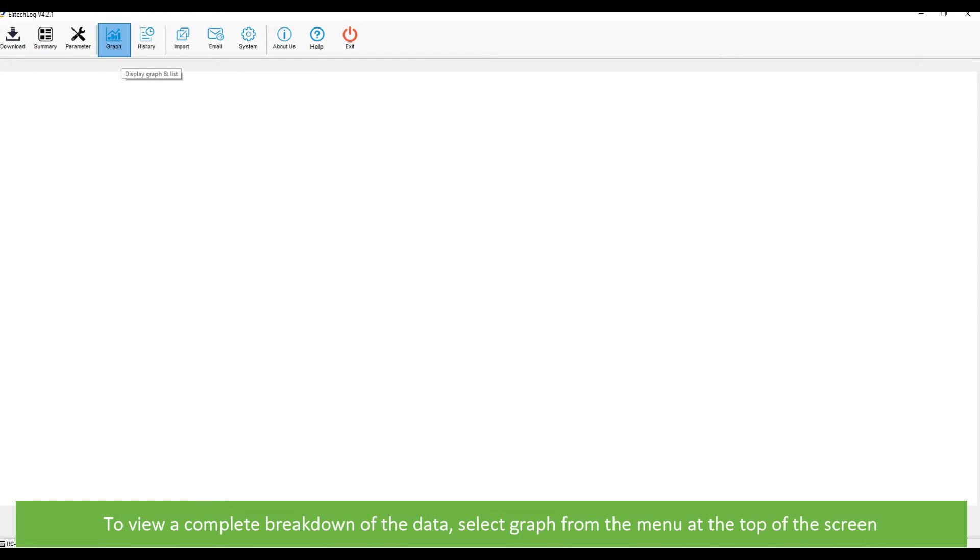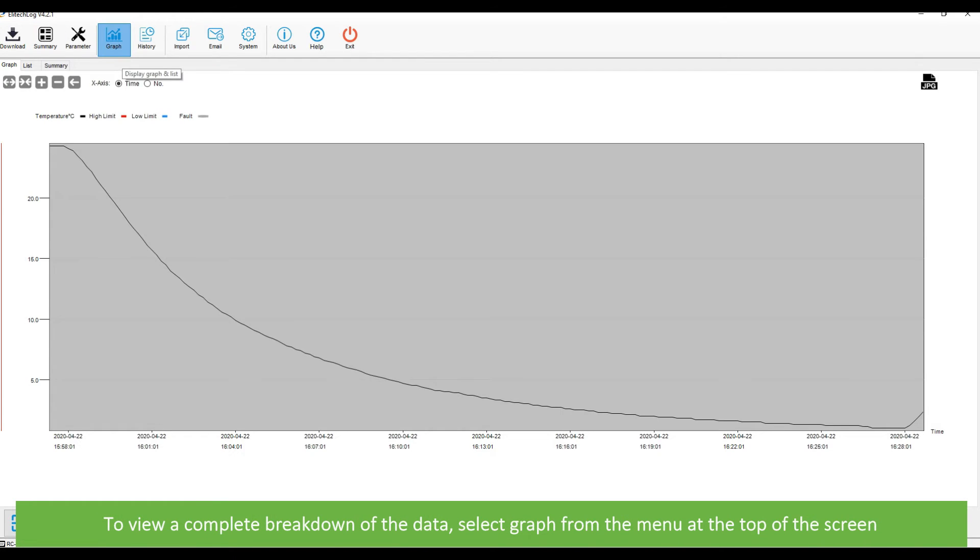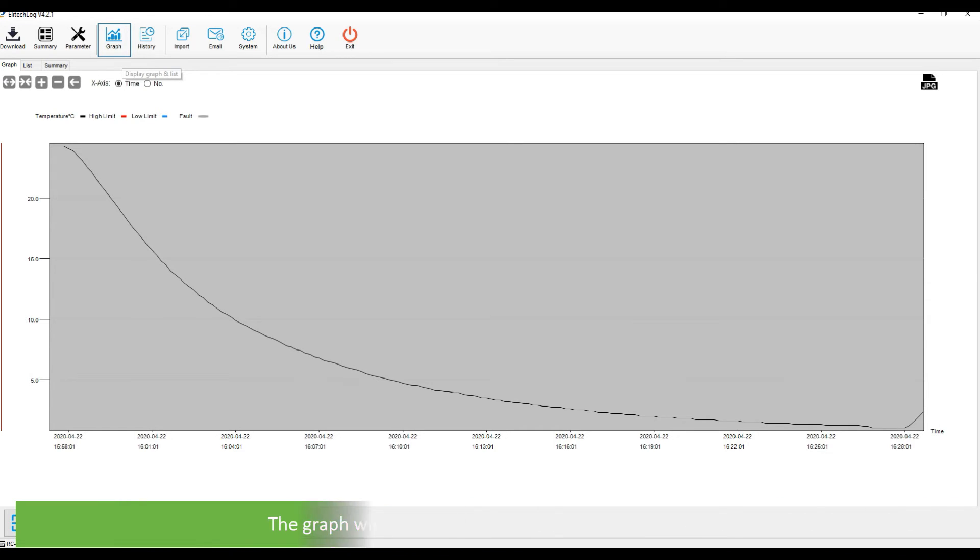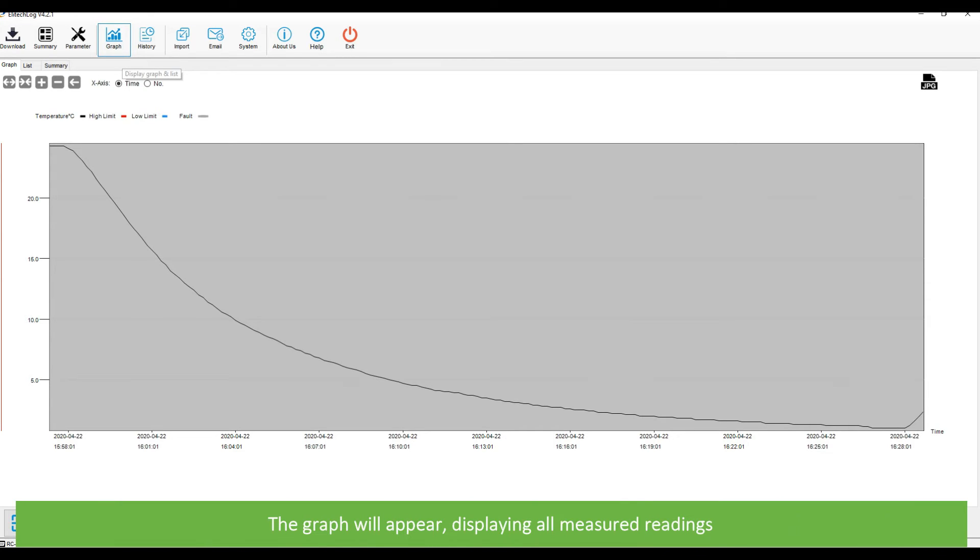To view a complete breakdown of the data, select graph from the menu on the top of the screen. The graph will appear displaying all measured readings.